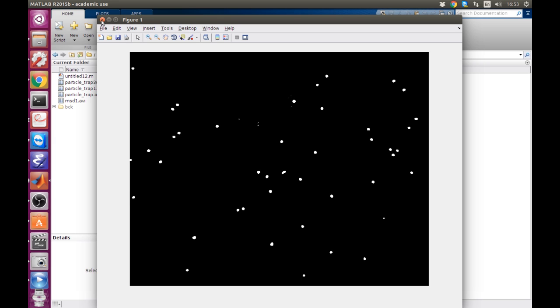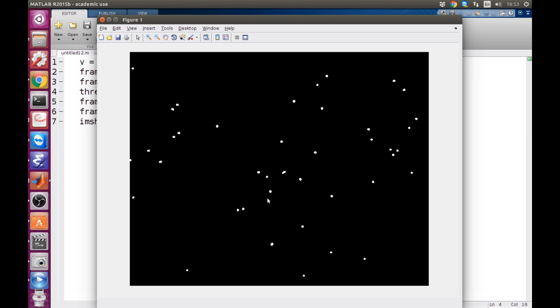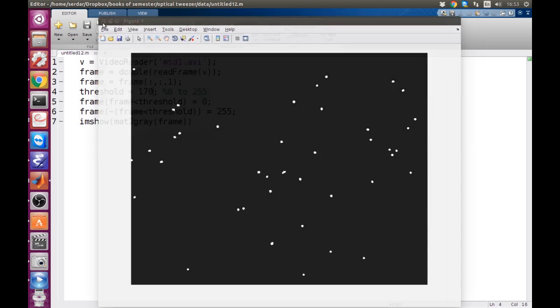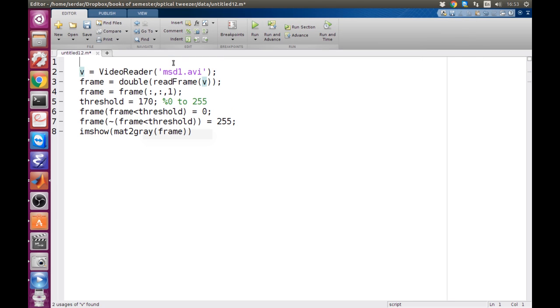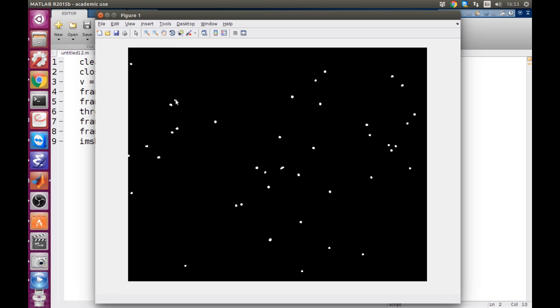So we're going to increase the threshold. By the way, let's do it like this. We're going to increase the threshold to 170. Now this is looking better. Let's do clear all, close all. I just want to check again. Okay, this is looking better.